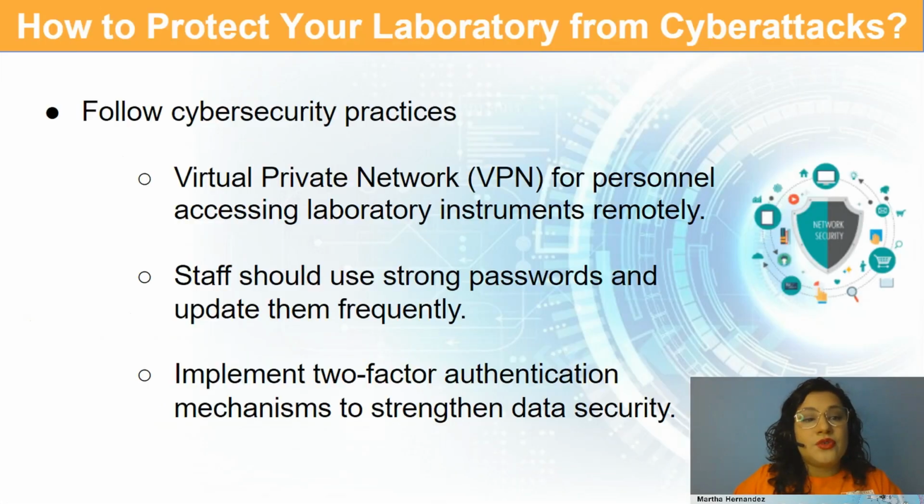Also, they have to follow cybersecurity practices. The laboratories must ensure secure remote access via a virtual private network, or the famous VPN, for personnel accessing laboratory instruments remotely. Identifying vulnerabilities early is critical to managing these security measures as soon as possible.